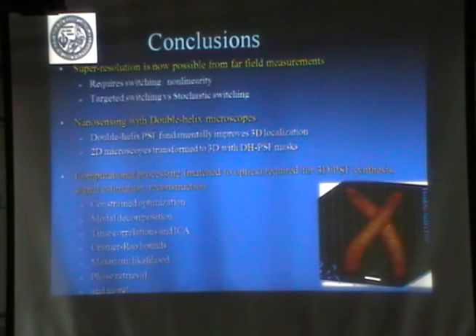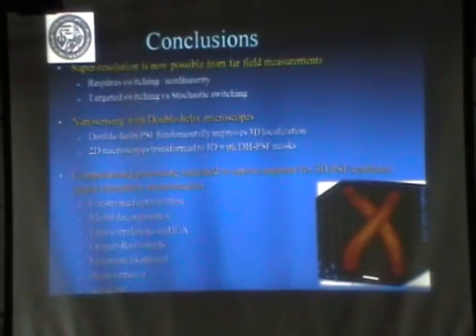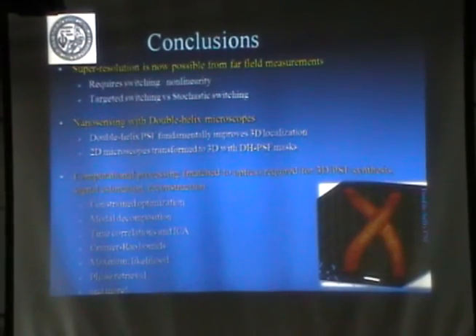We've done it. That's not a problem because you calibrate the system. So if there are deviations from the design, as long as they are not very dramatic, it still works because you calibrate the pattern, and then you use this phase retrieval to get the exact PSF. So let's say your PSF doesn't look like this, but it's going to look similar. It behaves essentially the same. It's quite robust to this type of aberrations.